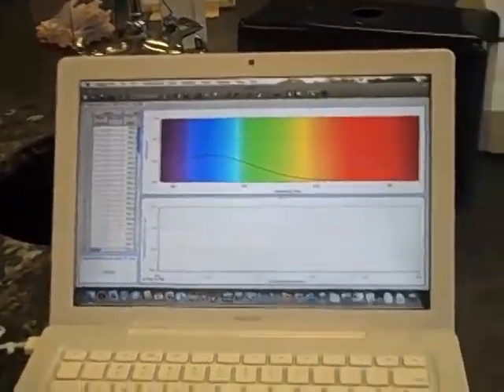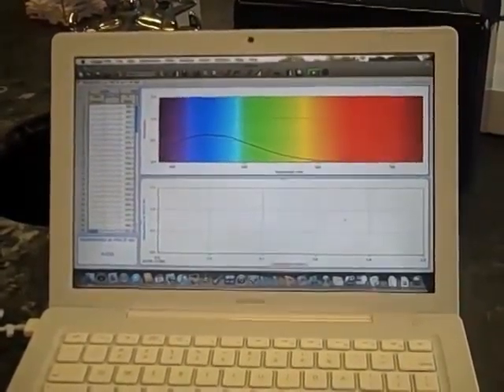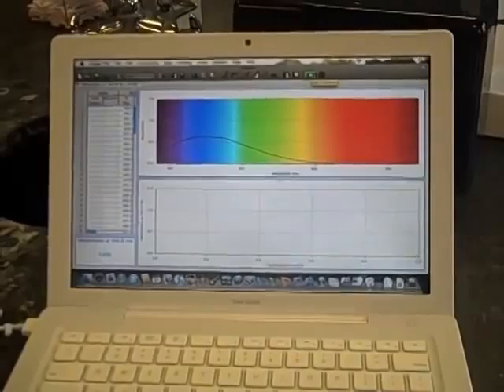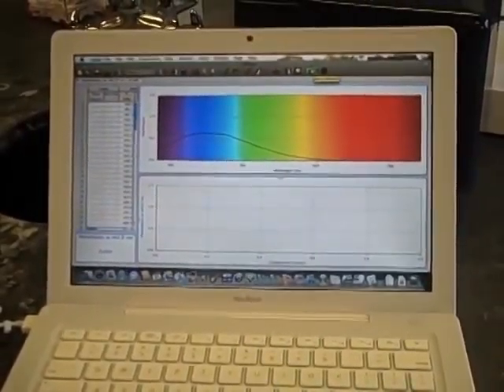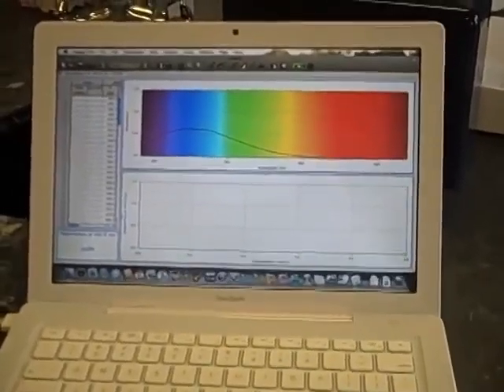Yeah. Okay. And now you're going to leave number 1 in there, and now you're going to begin your data collecting with number 1. So you're going to press collect again, and now you're not going to press stop collecting until the very end. And that's something that a lot of kids do. They press stop in between each one, but that's going to create problems. Follow the instructions, right? Okay. So, and here we go.